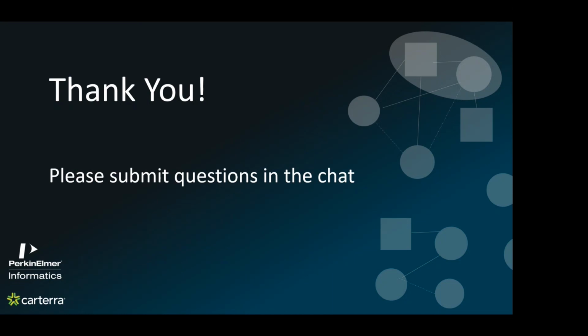How is data collected and moved from the LSA into a location that can be accessed by VitroVivo? That's a good question. That would be a little bit dependent on the setup at the particular site. There are different IT rules and things like that. But at a high level, the LSA collects data and stores it locally on the instrument PC. From there, it can be moved in a manual or automated format to additional locations.